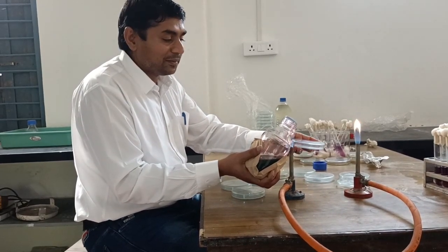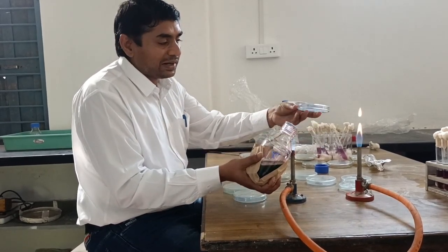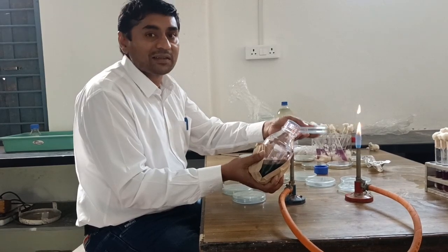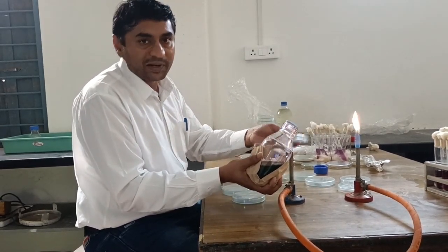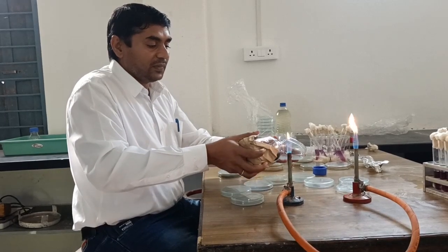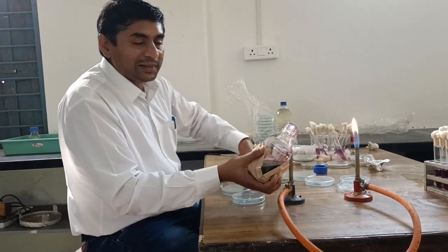Fill the petri plates sequentially in this manner. Always flame the mouth of the bottle or flask containing medium — that will prevent the entry of organisms or contaminants, as well as kill any organisms present on the mouth of the bottle or flask.